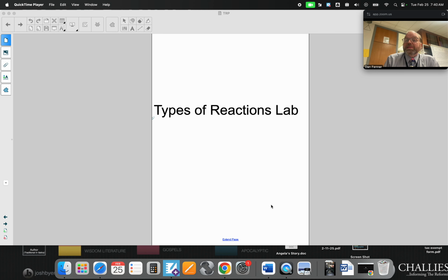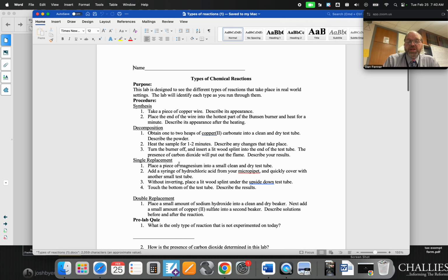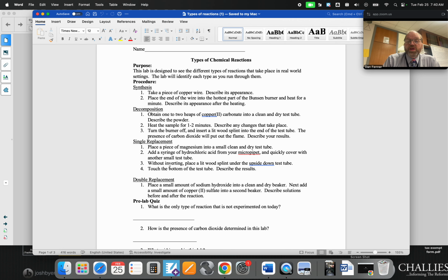We're going to show you some labs today, types of reaction labs. So here's the lab. Maybe if I get a chance, I can come out. We're looking at synthesis, decomposition, single replacement, and double replacement labs. You can either download this or copy it down.